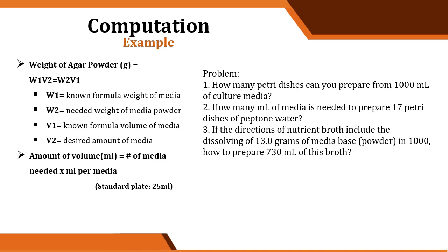Okay, so the amount of liquid media poured in each petri dish is about 25 ml. Okay. So, with the given info, so try to answer po yung following problems. Okay? So, this one, balikan natin to sa face-to-face natin ha. Kasi, ang hirap magsulat dito using the mouse. Okay? So, para mas maintindihan po natin. So, for now, parang little sit work muna for you guys. Okay?